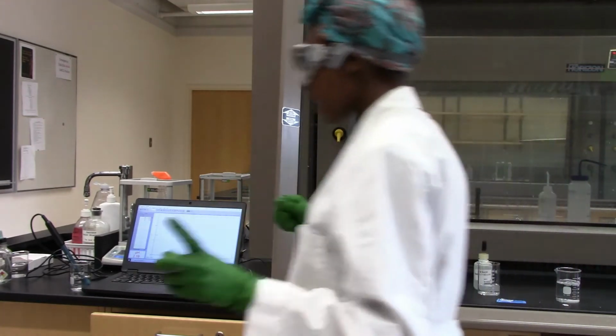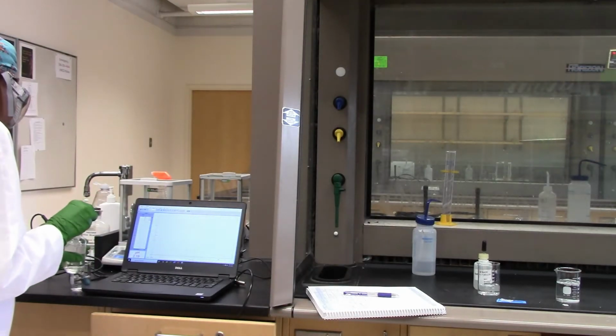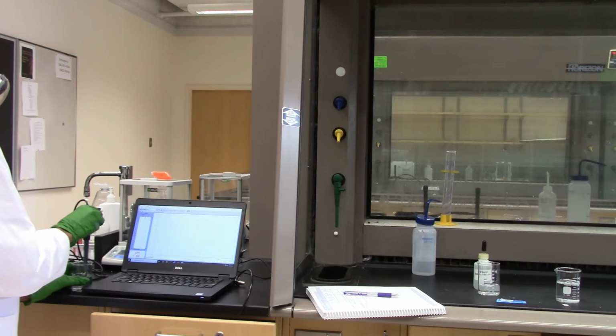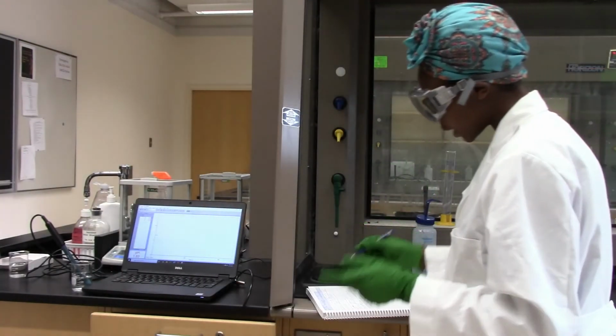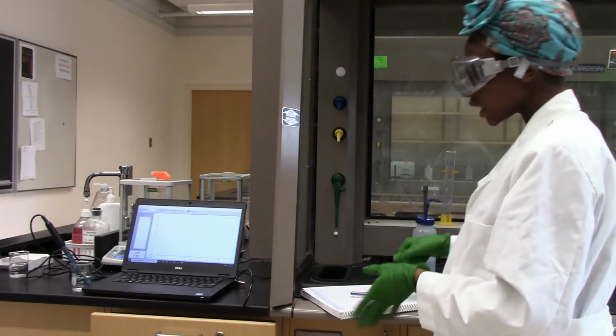I'm going to do 5 more drops of HCl. And I'm recording all of these values in my notebook. This is 1.83.